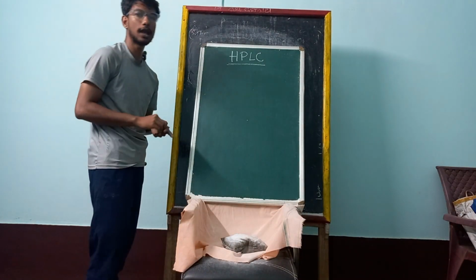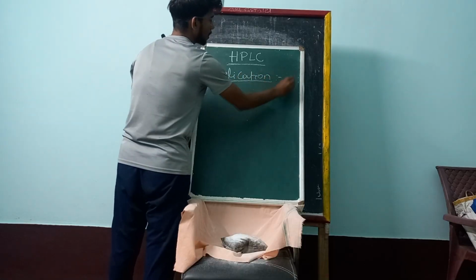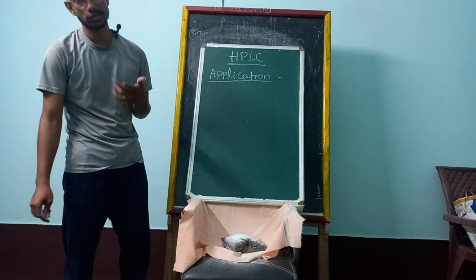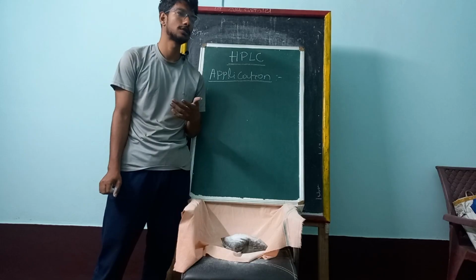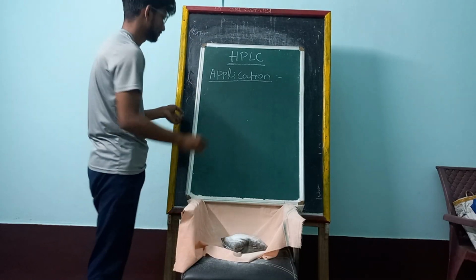Now we are going to the applications of HPLC. HPLC is mostly used in various pharmaceutical industries, in environmental analysis, and in food analysis.